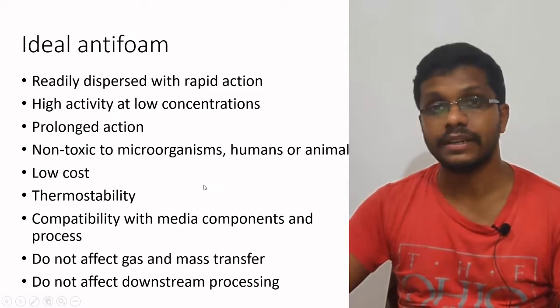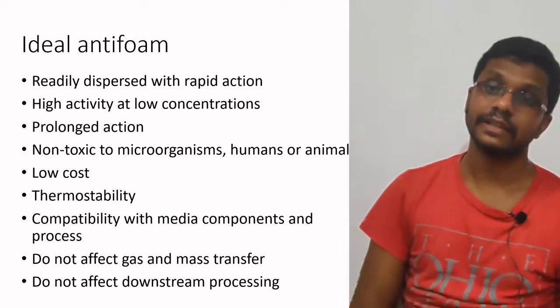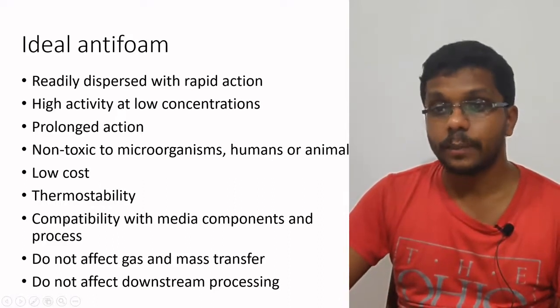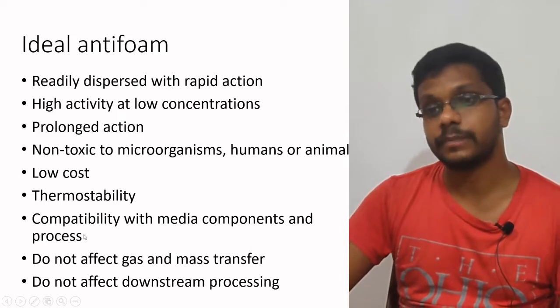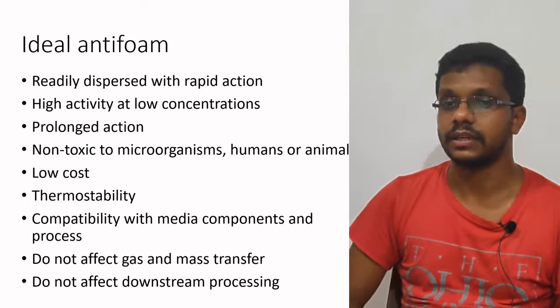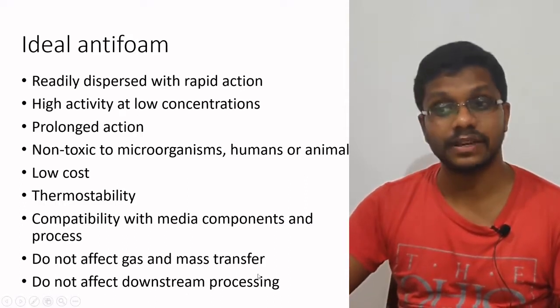Thermostability: it should be stable at high temperature because some of the fermentations are happening at 55-60 degrees Celsius. So the antifoam agents should be thermostable. It should be compatible with the media components and the process. It should not react with the media components or interfere with the process, so it does not affect gas and mass transfer.